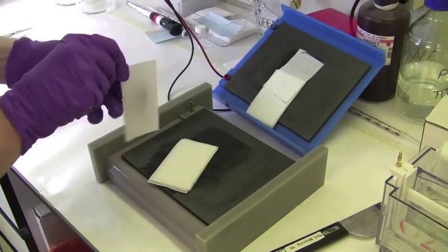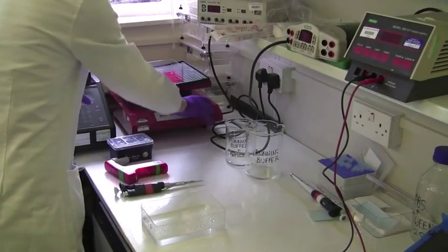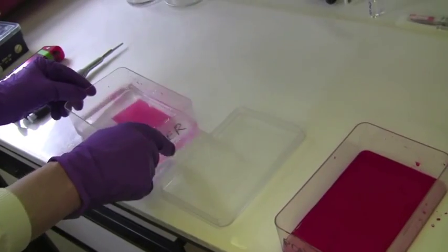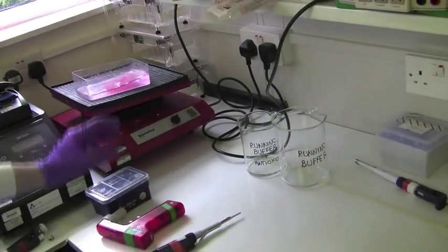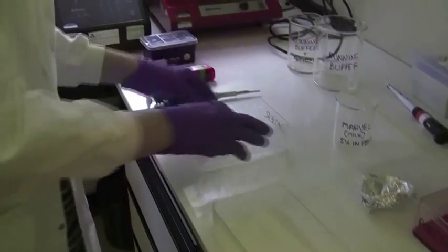In order to examine the efficiency of the transfer of the proteins from the gel to the membrane, it is usually stained for total protein. As it is important that the stain does not affect either the antibody binding or its detection, a protein stain should be chosen which might be easily removed, such as Ponceau Red. After incubation for about 5 minutes, the membrane is repeatedly washed in double distilled water until well-defined protein bands can be seen.